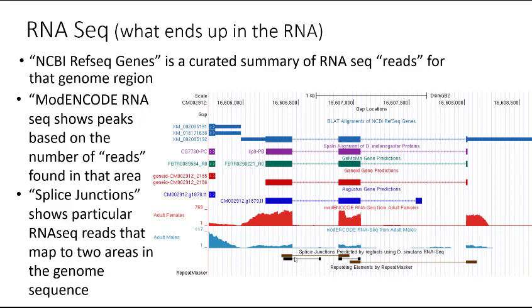So for example, this brown one down here actually had a little part that was similar to this region right over here, and it had another part that was similar to this region over here. The line was actually not found in the RNA, and therefore it's very strong evidence that in at least several RNAs, this was a region that was spliced out of the messenger RNA and likely is an intron.